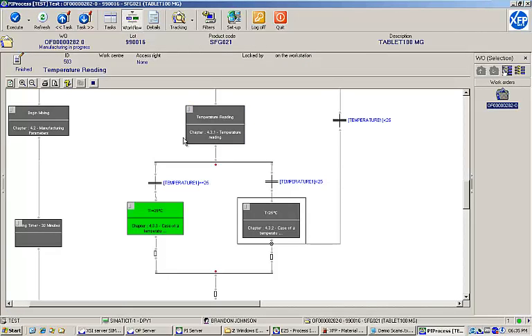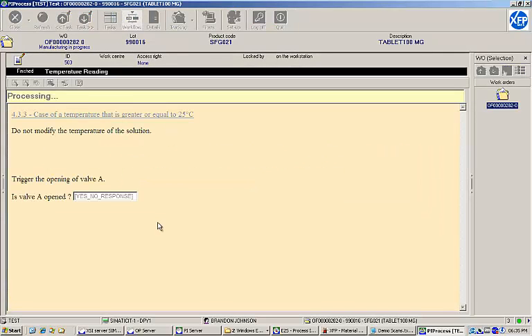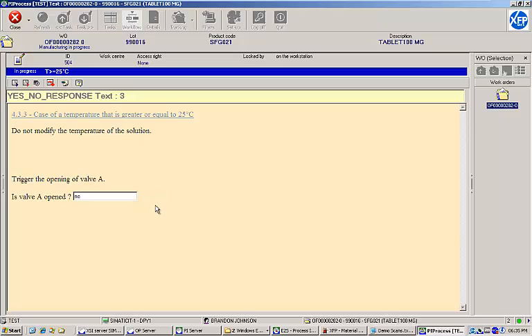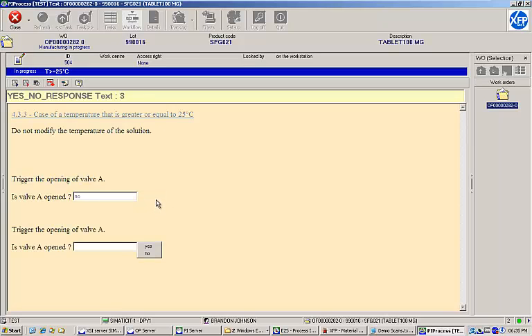We are prompted not to modify the temperature any further and then to open valve A. When asked if the valve has been opened, if we answer no, then we are not allowed to proceed. The EBR waits for us to confirm the valve is open before continuing.